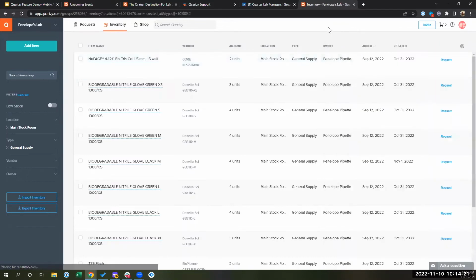Great answer. Is it possible to adjust the size of the printable barcode from the Word document? Right now, I don't believe that is supported. Actually, Libby, sorry, just to jump in. When you download it, we can't adjust it from the print action. But when it's in the Word document, it is fully editable.